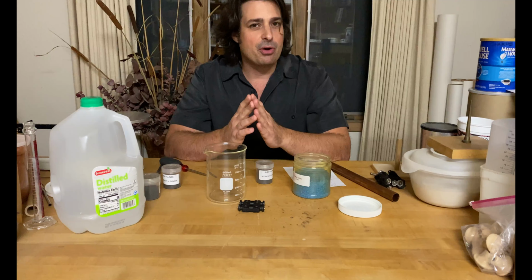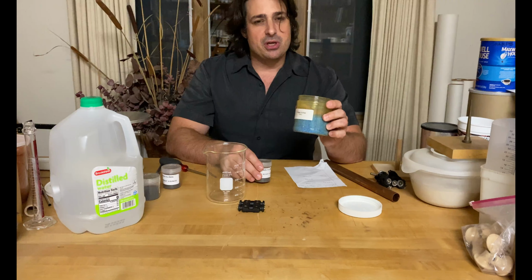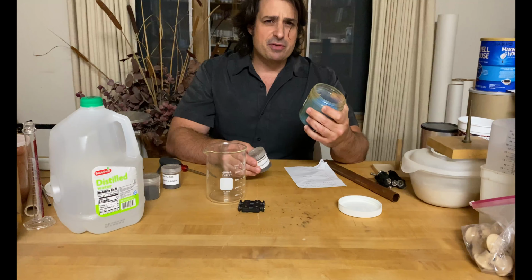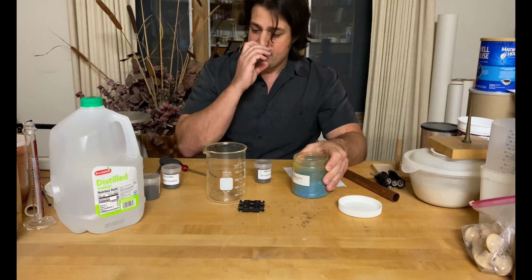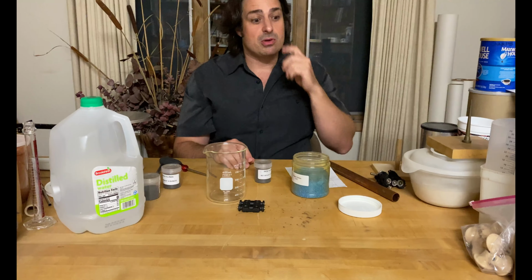We simply don't know. So, blue vitriol is the substance we'll be working with. There's also green vitriol, which will be a byproduct of this reaction, that is iron sulfate. Let's cover a few basics before we start to mix the chemicals.